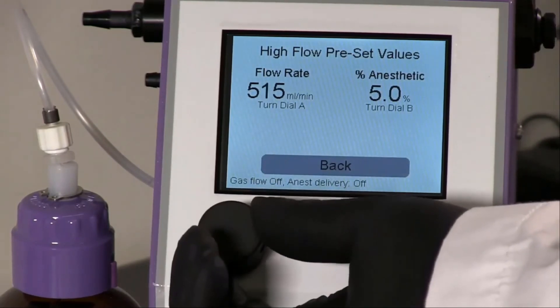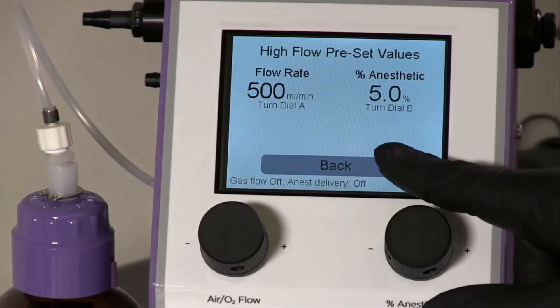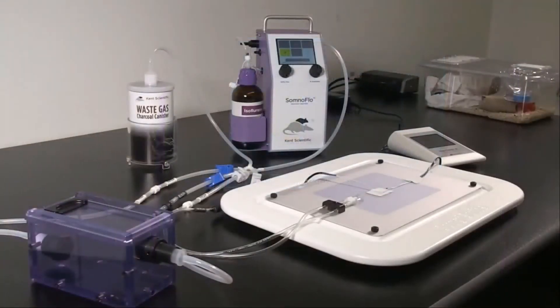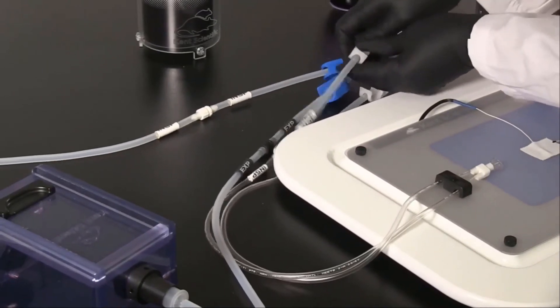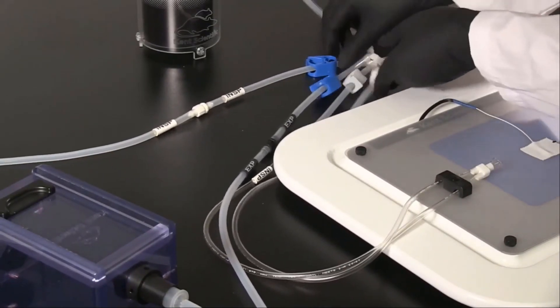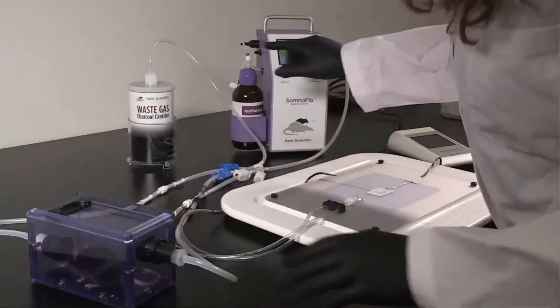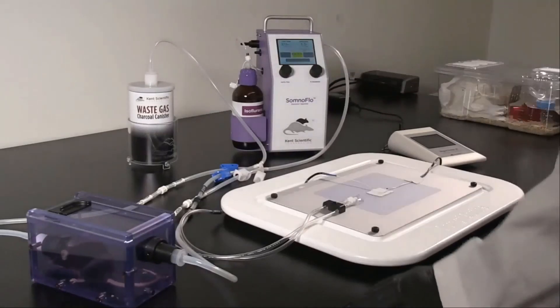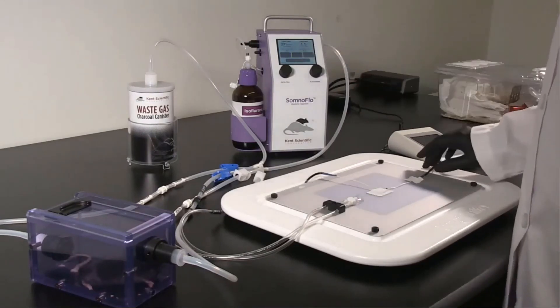Even though you have entered flow rates and anesthetic concentrations for each phase, you can still adjust these parameters during anesthesia delivery from the run screen. Now that your tubing is set up and settings are saved, you're ready to begin anesthetizing an animal. Adjust the clips to direct airflow to the induction chamber. Place the animal in the induction chamber and touch High Flow. The SomnoFlow will begin delivery at the settings selected in your High Flow presets. Use the dials to make adjustments to the flow rate or anesthetic concentration as needed. When the animal is fully anesthetized, touch High Flow again to stop delivery.